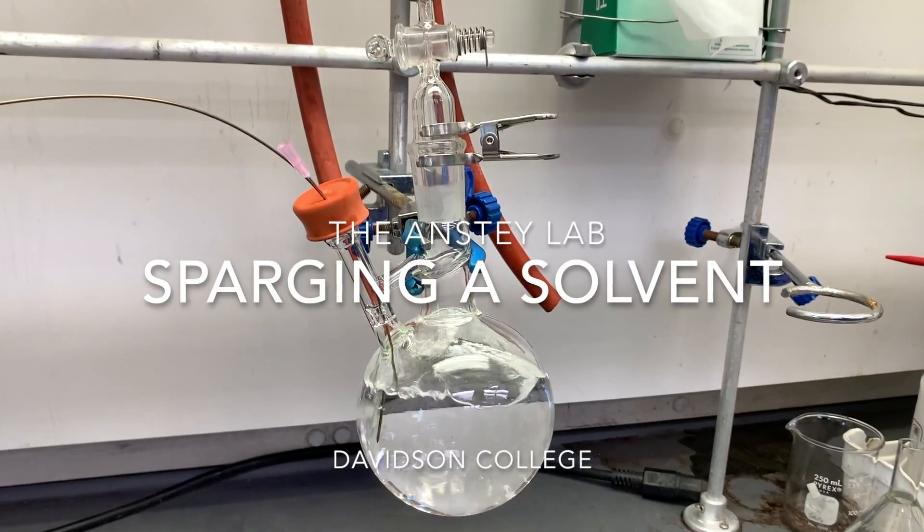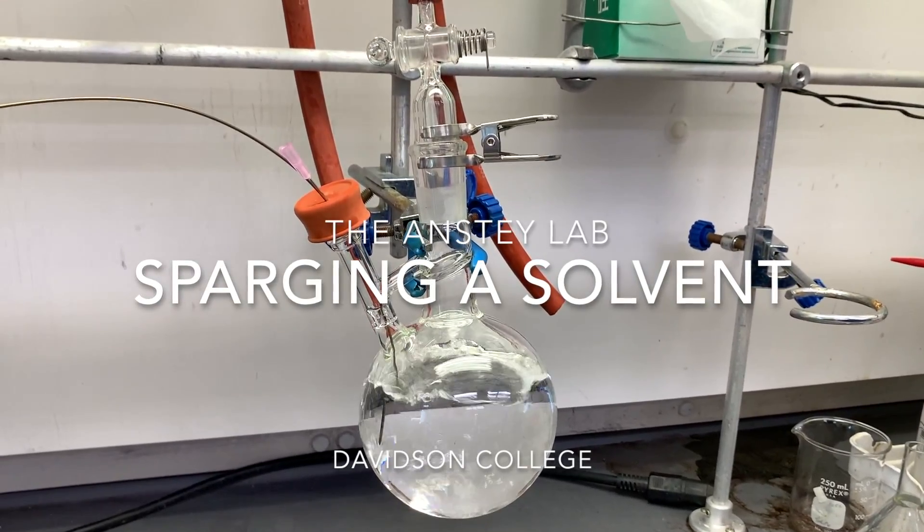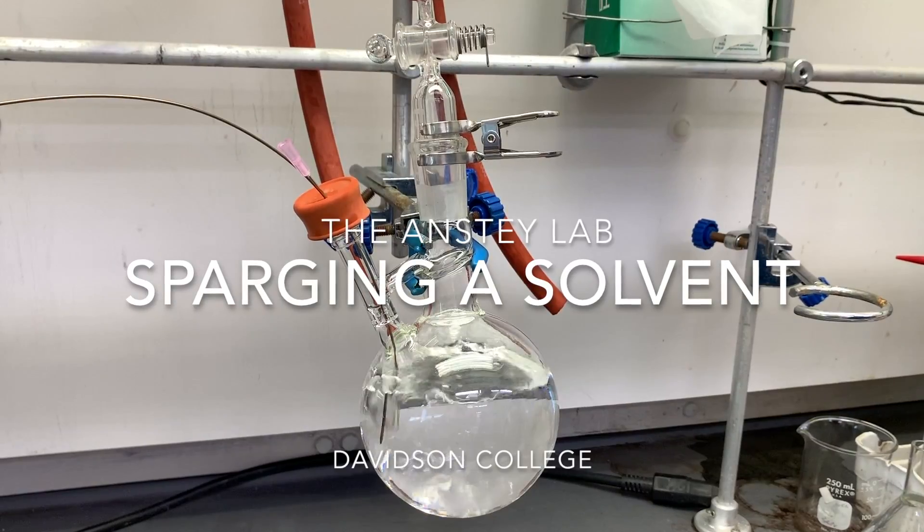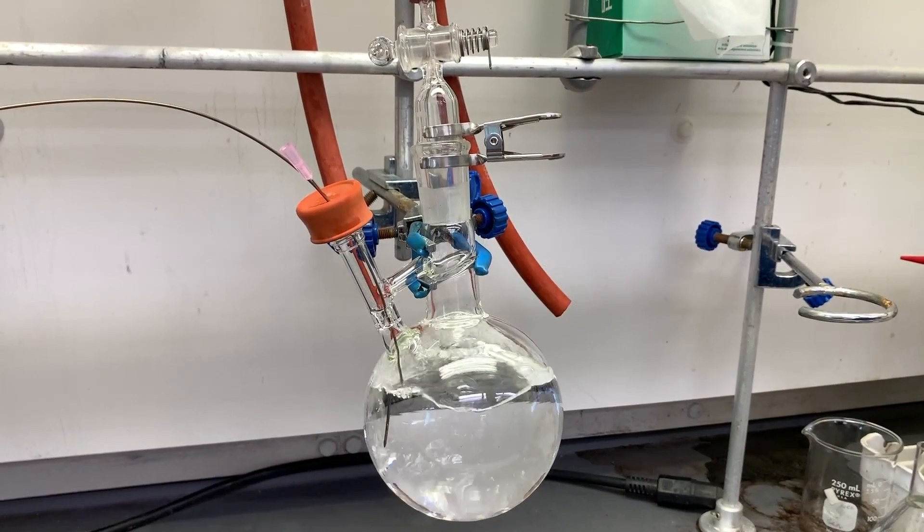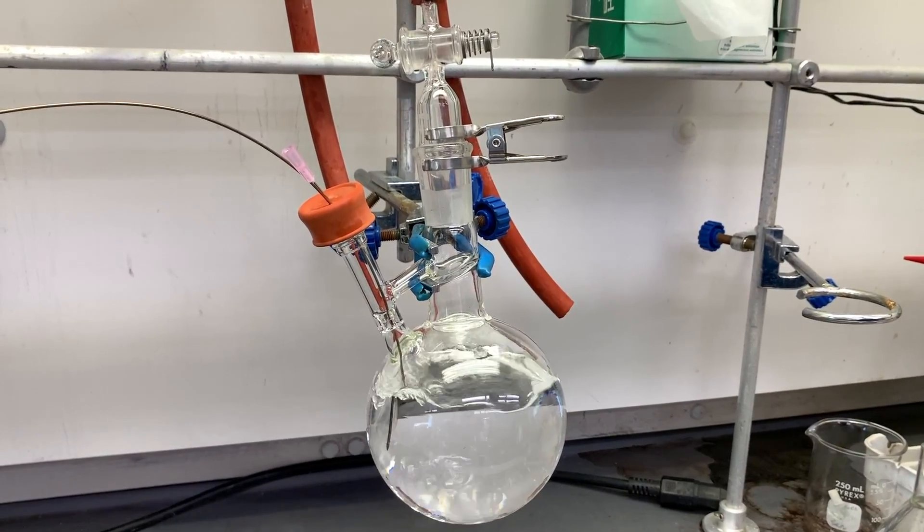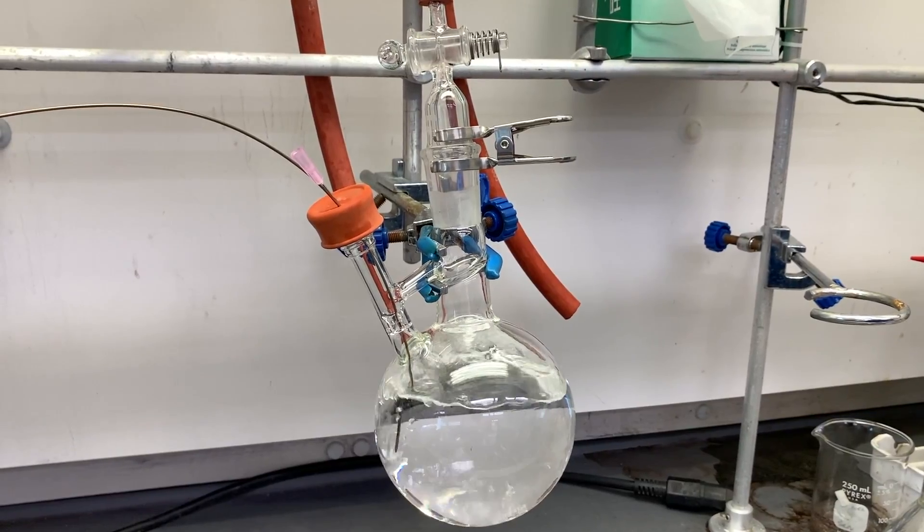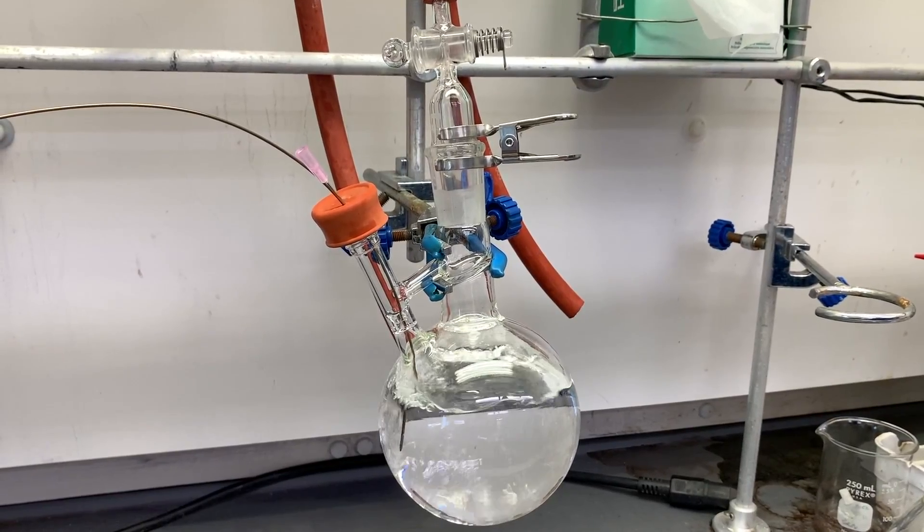Sparging your solvent! Working in an anaerobic environment like the one we have on a Schlenk manifold or in a glove box means that molecular oxygen dissolved in liquids has to be removed before we can use them. The most straightforward technique to do so is called sparging.